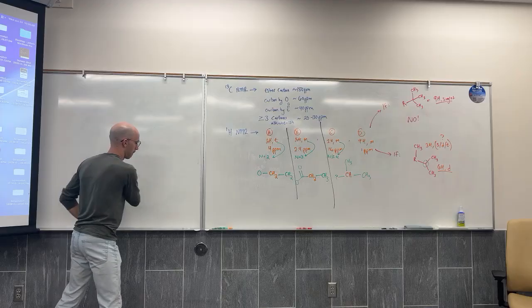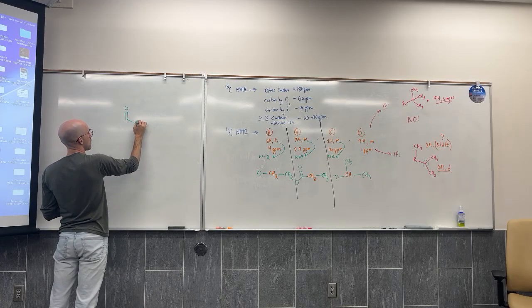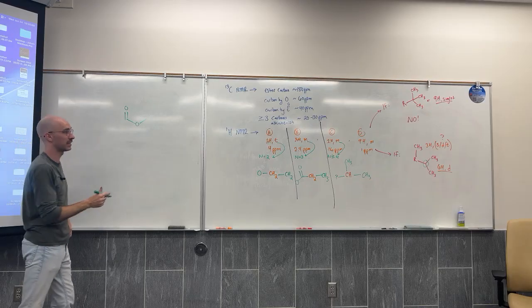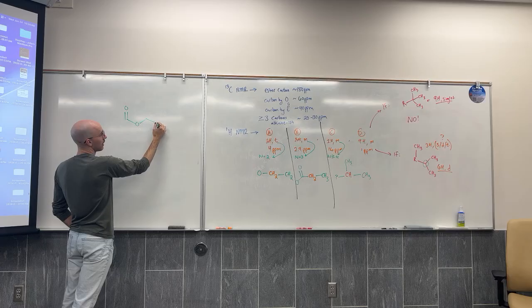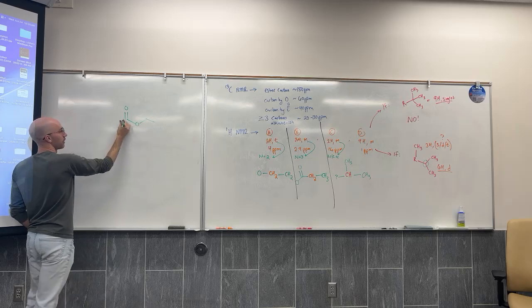An ester with what is looking to be a lot more like a CH2. A CH2 for sure.